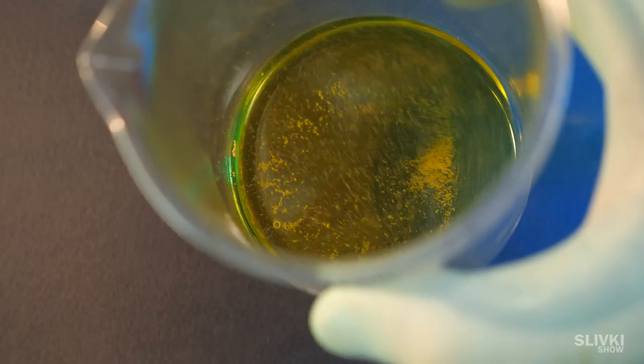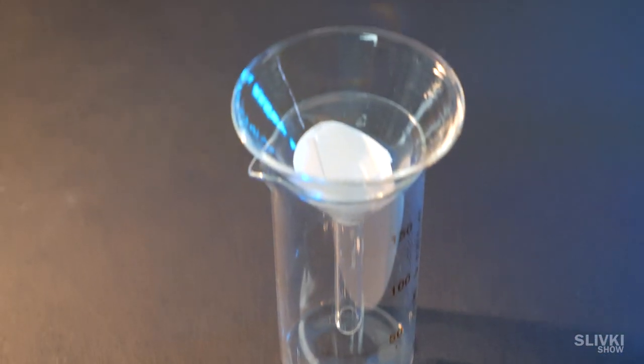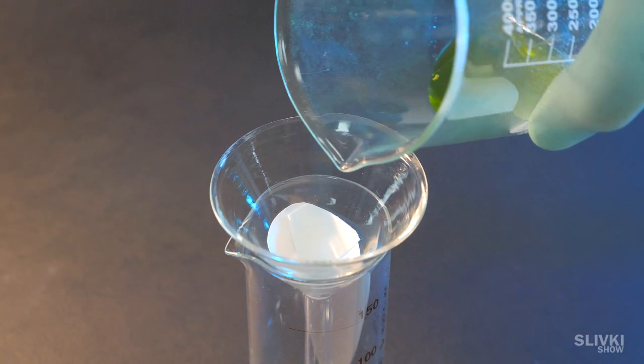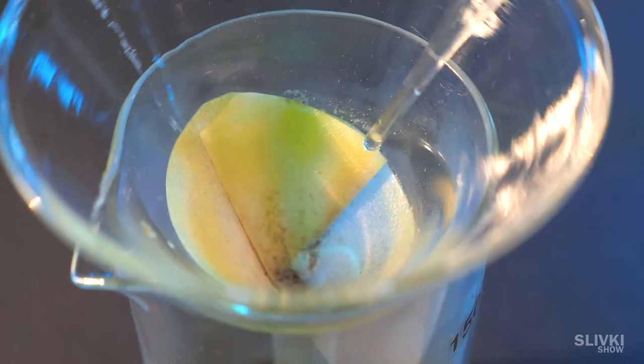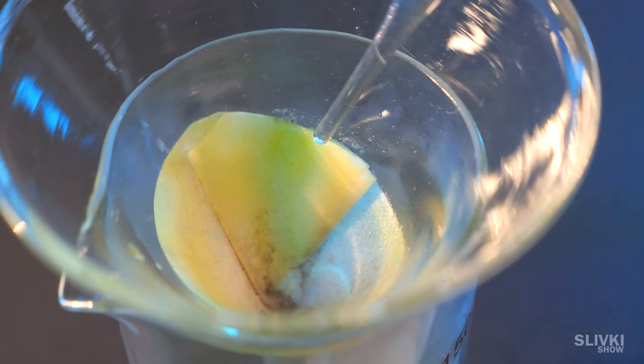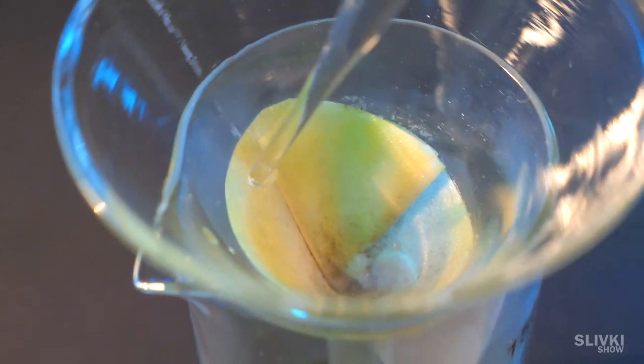In this process, we got a little bit of sludge. That's why we take a different container and transfer the substance with gold through a filter. And the filter itself we rinse with water so it won't have any precious gold liquid.